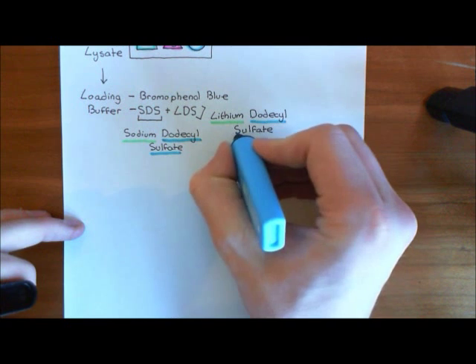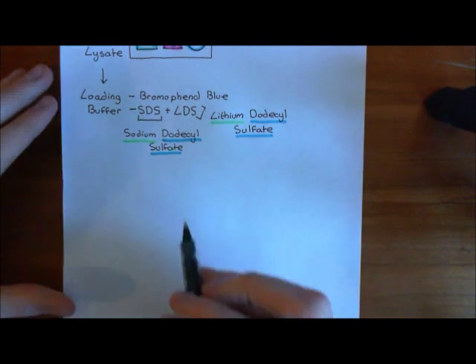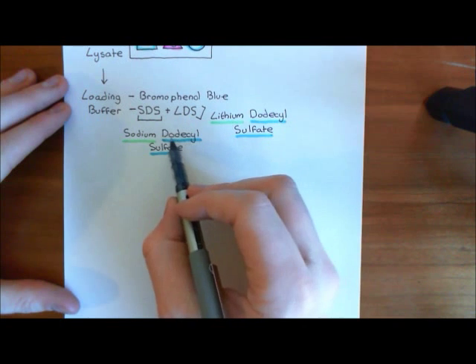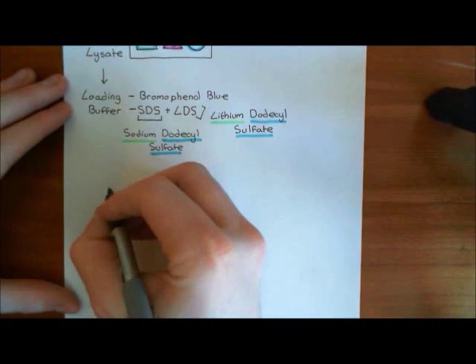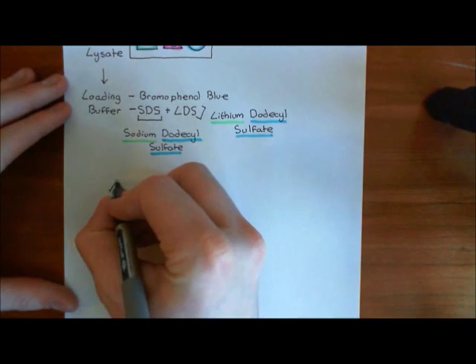So let's discuss the structure of the dodecyl sulfate anion, and then you'll have a cation bound to this. So dodecyl sulfate basically means that you've got a 12 carbon molecule with a sulfate group right on the end. Okay, so let me draw the structure of one of these out for you. So basically, we'll draw the skeletal structure.